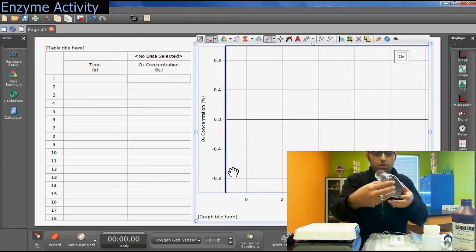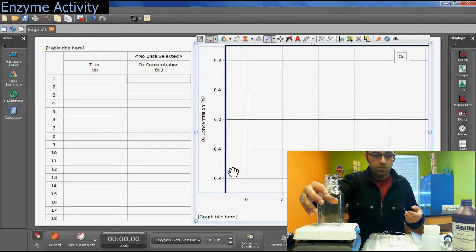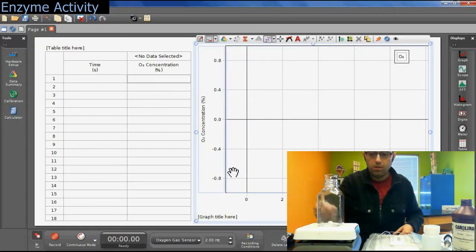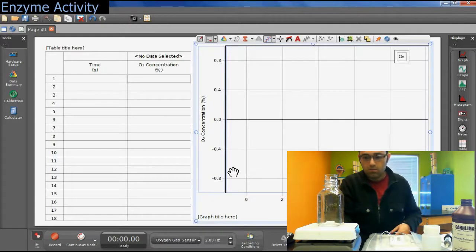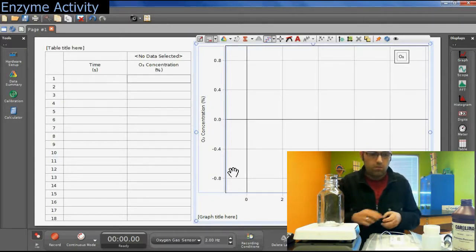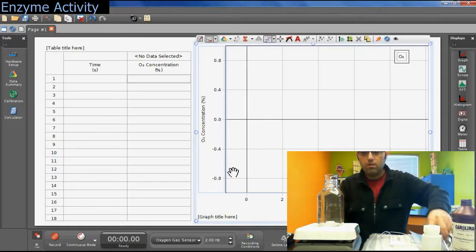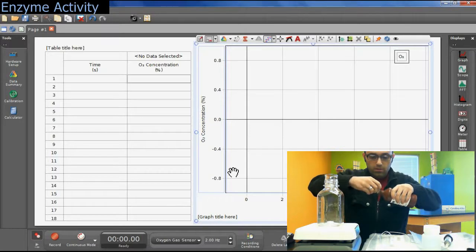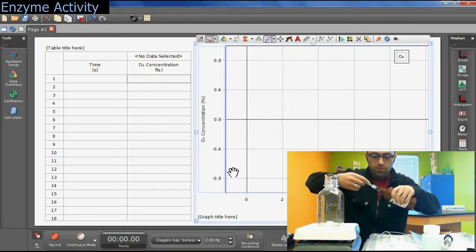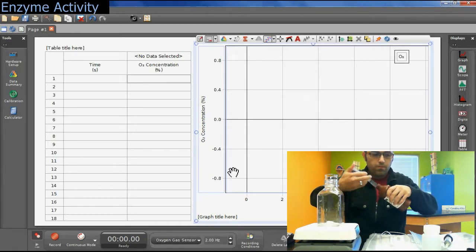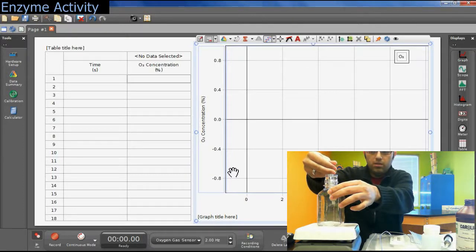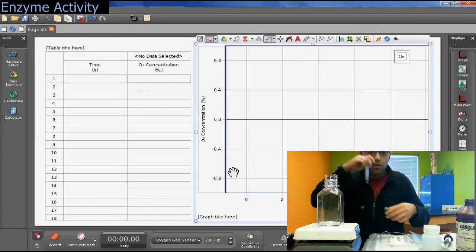You will place this container on top of your stir plate and use your magnetic stirrer — put it in there and start it to a moderate stirring state, about 5 out of 10 on the scale. You're going to measure out 10 mL of hydrogen peroxide using your syringe. Try not to get it on the sides of the container so that all 10 mL of hydrogen peroxide undergoes the reaction.